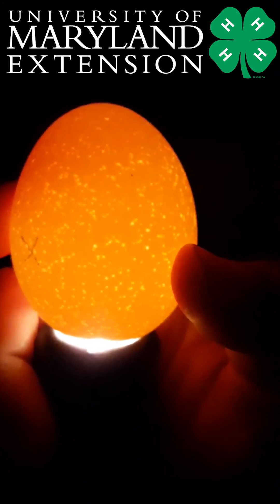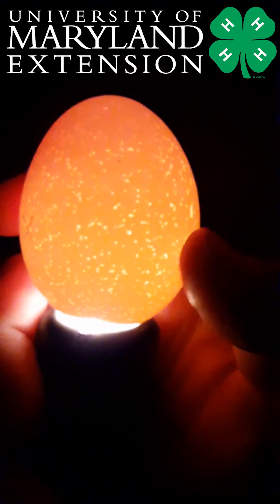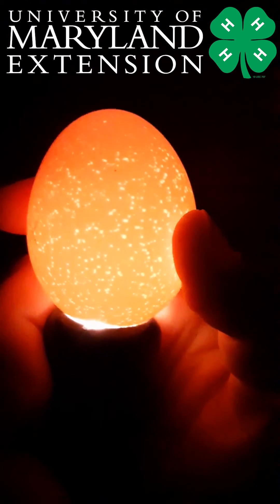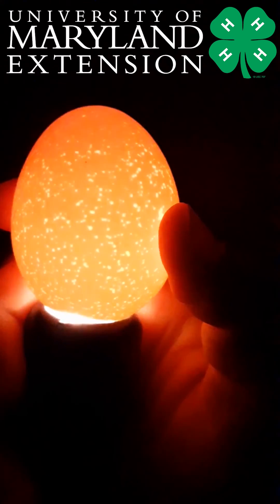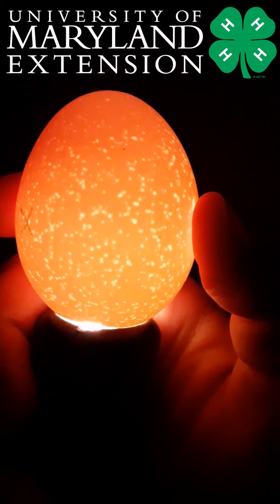Again, this is just within the first few days of our incubation so we don't really see anything growing right now. The lighter spots that you're seeing in the shell are just some areas where there's not as much calcium buildup, so it's just thinner areas of calcium in our shell.